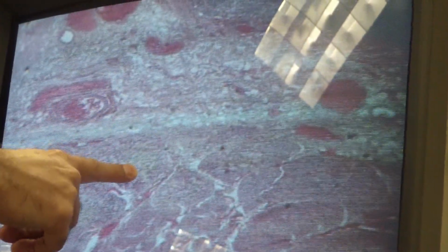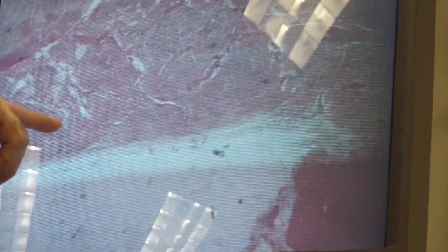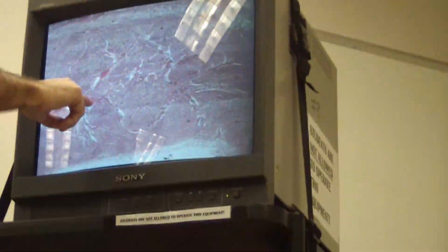Muscularis externa. And remember, since this is the stomach, in the case of the stomach, we have how many layers of muscle? 3. 3. So if this is the submucosa, the layer which is closer to the submucosa, that would be what? Oblique. This is the serosa, where there's nothing, or adventitia right here. So this layer would be what? Longitudinal. And half of it in between, that would be what? Circular. So oblique, circular, and what? Longitudinal. And then serosa or what? Adventitia.